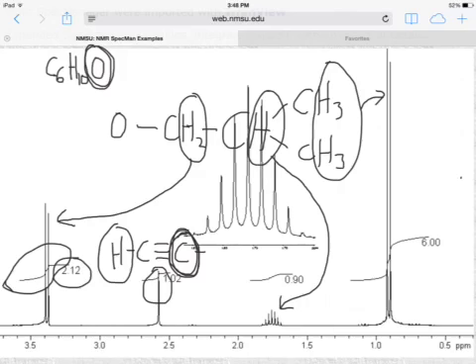And if it were a terminal alkyne in this molecule, that would take care of both our degrees of unsaturation because there's 2 additional bonds in here. So this would actually make all of the puzzle pieces fall together. I'm going to tentatively complete our molecule and then double check to make sure everything makes sense.